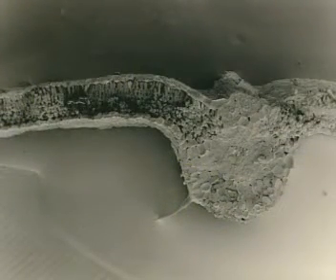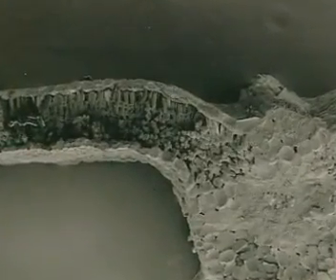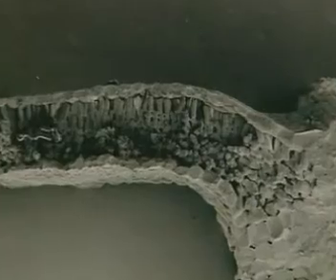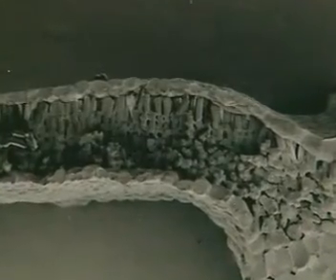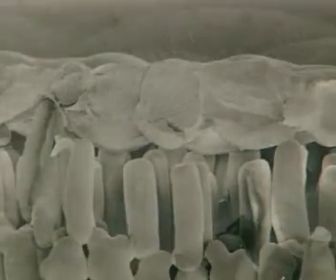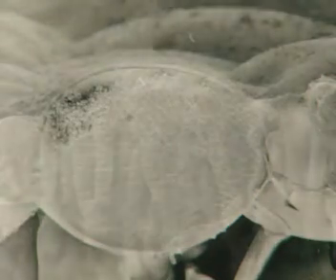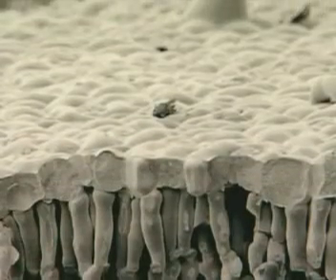This is a slice through the same leaf, magnified many thousands of times with a scanning electron microscope. You can see the individual cells and how they differ in shape and size. This is an epidermal cell. A layer of these cells joined together forms the surface of the leaf.